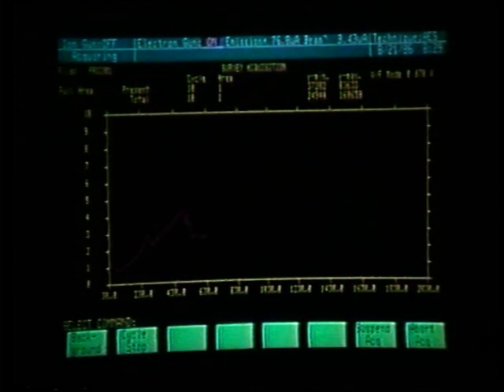We will want to redisplay this survey scan and differentiate it to find if there are any new elements present in this area that we did not see in the first area. The survey is now complete.